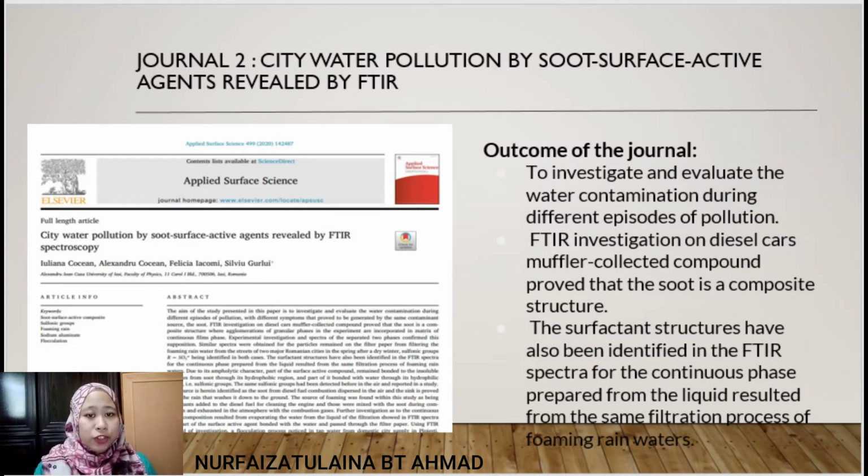FTIR investigation on diesel cars' muffler-collected compound proved that the soot is a composite structure where agglomerations of granular phases are incorporated in a matrix of continuous film phase.